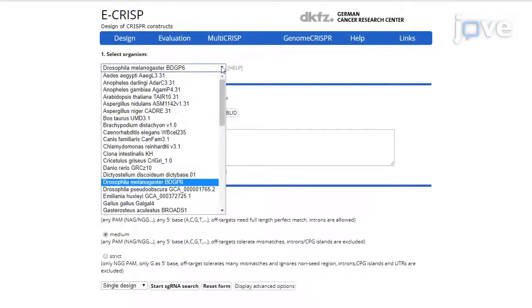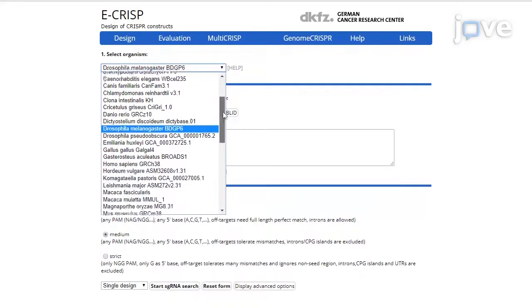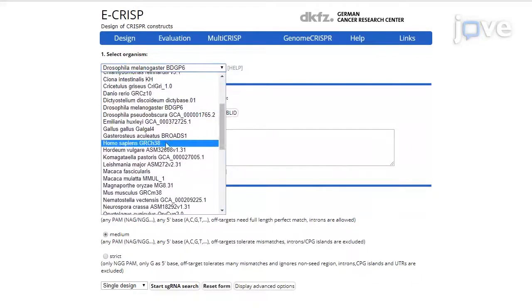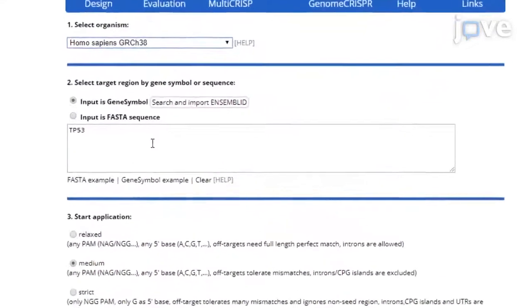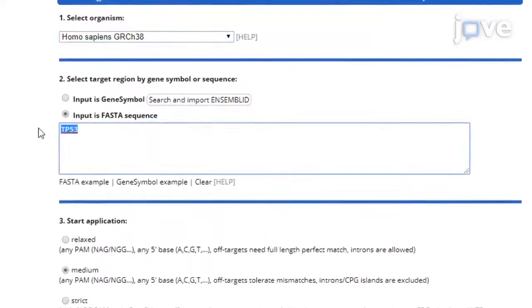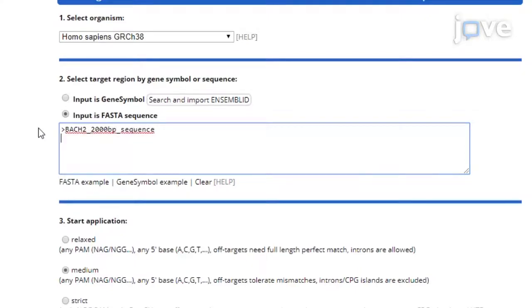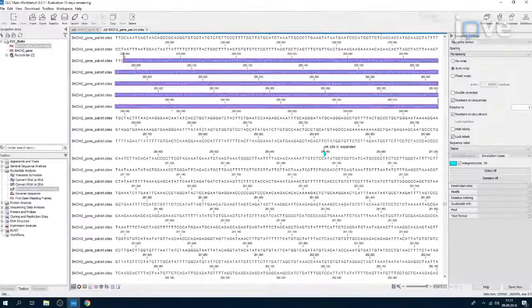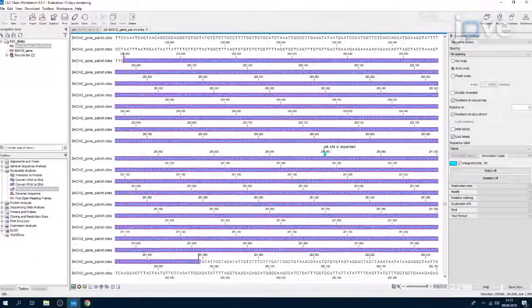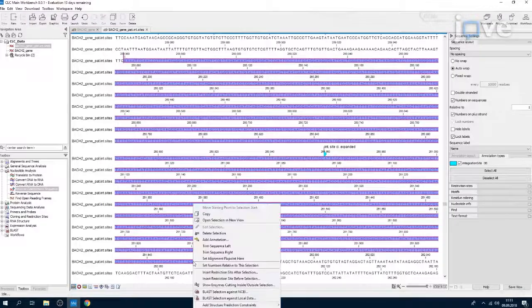Then select Homo sapiens genome reference Consortium Human Genome Build 38 as the organism and input 2000 base pairs of the genomic sequence covering the desired genomic locus previously extracted.